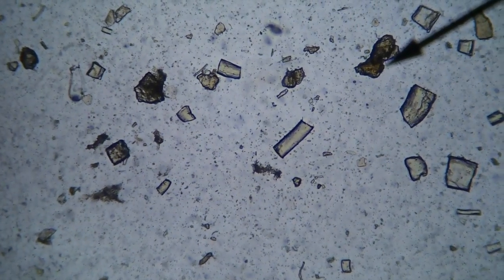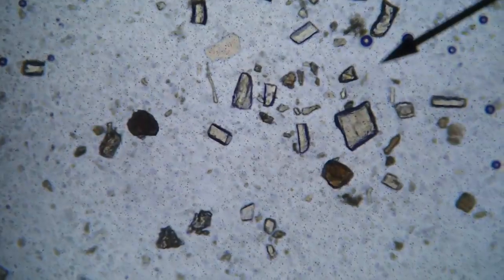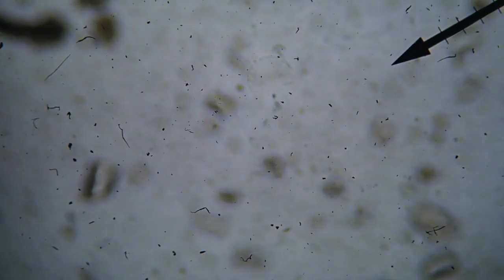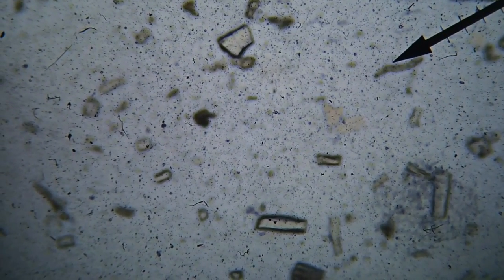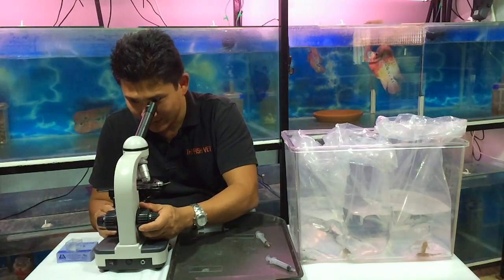This is a microscopic examination of the Panda Corydoras. You can see a lot of just crud around. In the background there's some granular appearance — that's likely going to be bacteria that's proliferated since the feces was passed. There's a little free-living protozoa there that helps break down the feces, and a lot of likely fillers in the food that help with intestinal health. All you can see is basically a lot of plant material and detritus, with bacteria in the background — that's likely proliferation after the feces has been passed.